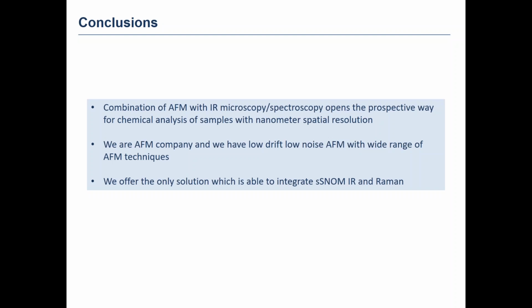Question is, how thin should the sample be for s-SNOM and AFM-IR modes? Well, in the scattering SNOM regime, we do not actually have limitations in the sample thickness. It is the optical response from the sample, and we can measure the optical amplitude and optical phase of the backscattered light that corresponds to its dielectric permittivity, so we can do it on both thin and thick samples.